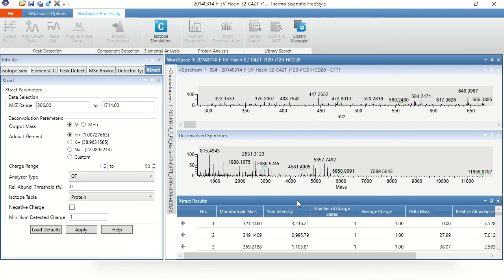And in this case, the spectrum list is shown automatically. I automatically get my list of precursors. My list of fragments. But I want to note that in this case, the relative abundance is not the sort order. Now the monoisotopic mass is labeled monoisotopic mass instead of M/Z, and it's sorted by that list. So that's very helpful. This is more what most people, I think, would expect when doing a tandem mass spectrum. But be aware that the spectrum list that you get from the Xtract all raw file is different in its labeling and in its ordering than what we see in this case.